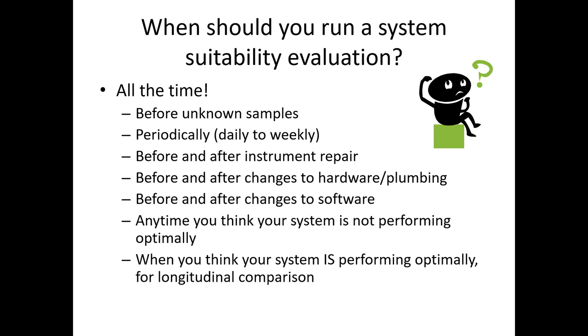You look at things like peak area, peak symmetry, signal to noise, how the data look, peak separation from the chromatographic standpoint, and so on. And then from that point on, once you have a decent benchmark, you just run it anytime you can, instead of letting the system sit idle over the weekend. If your queue stops on like a Sunday afternoon, queue up some system suitability runs. Keep the system going. Particularly with NanoFlow, these LCs like to stay pumping.